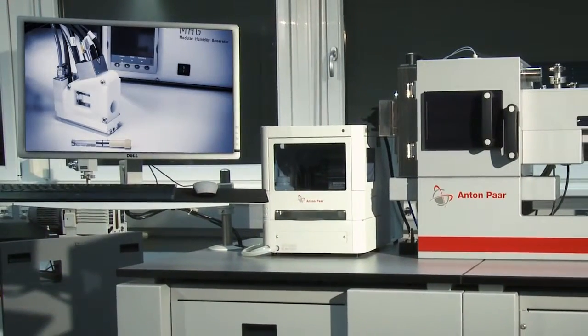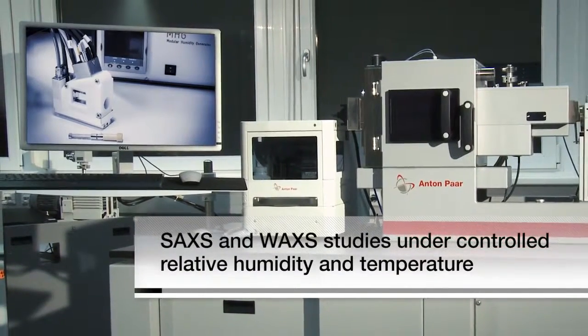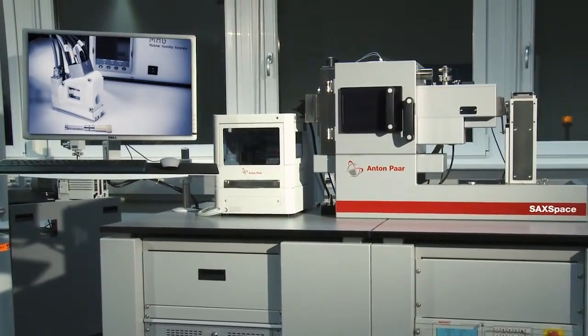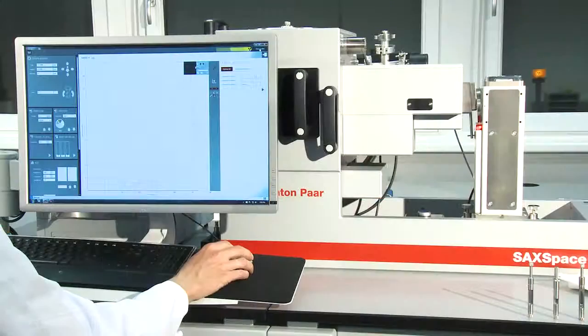Last but not least, powder samples can also be studied under controlled humidity and temperature using the humidity stage. Simply press start—the measurement is run automatically.